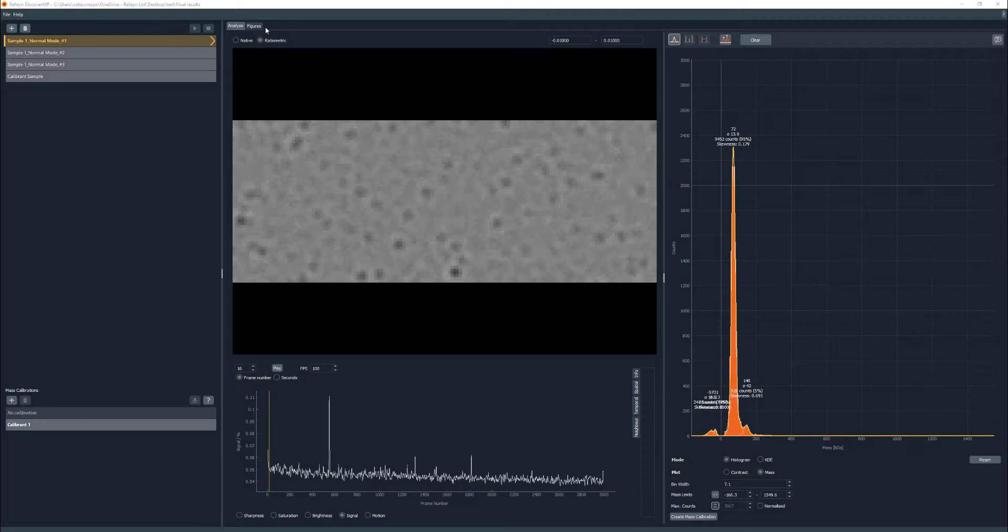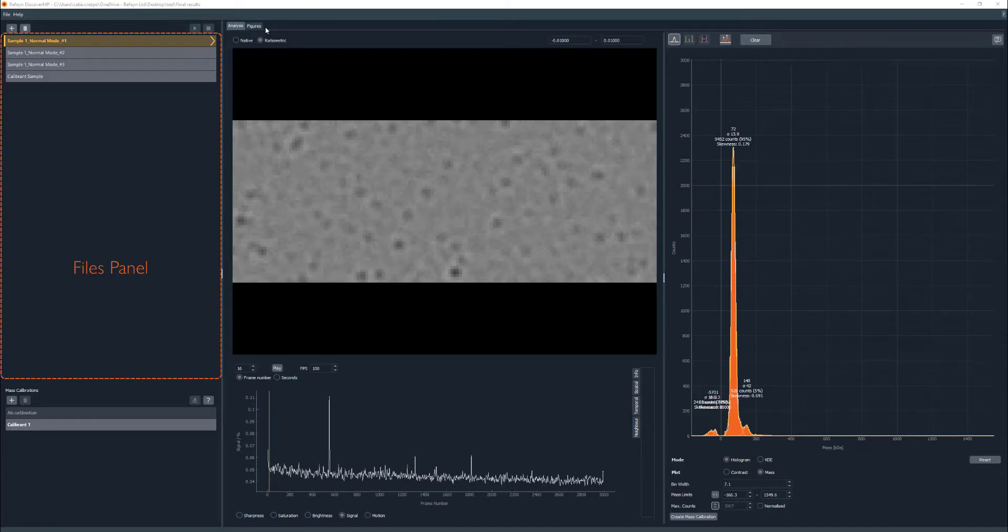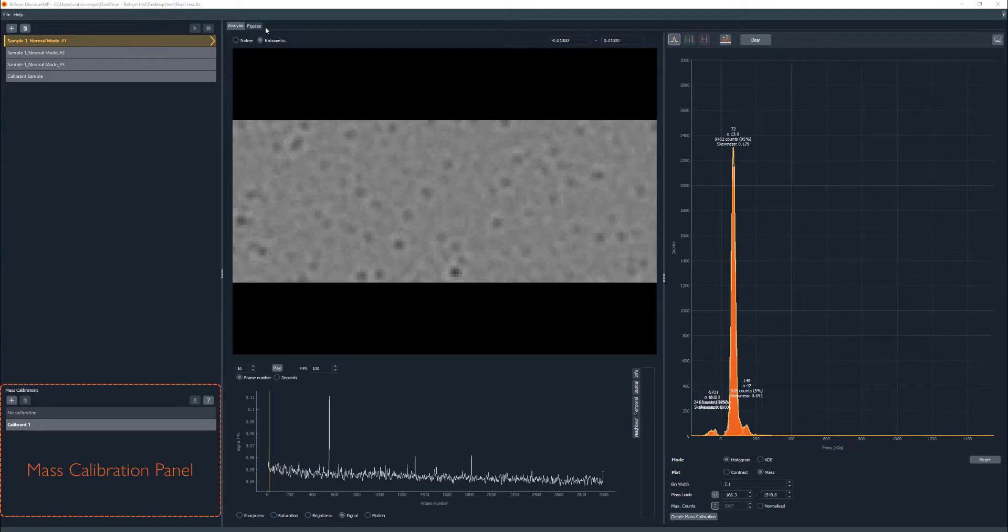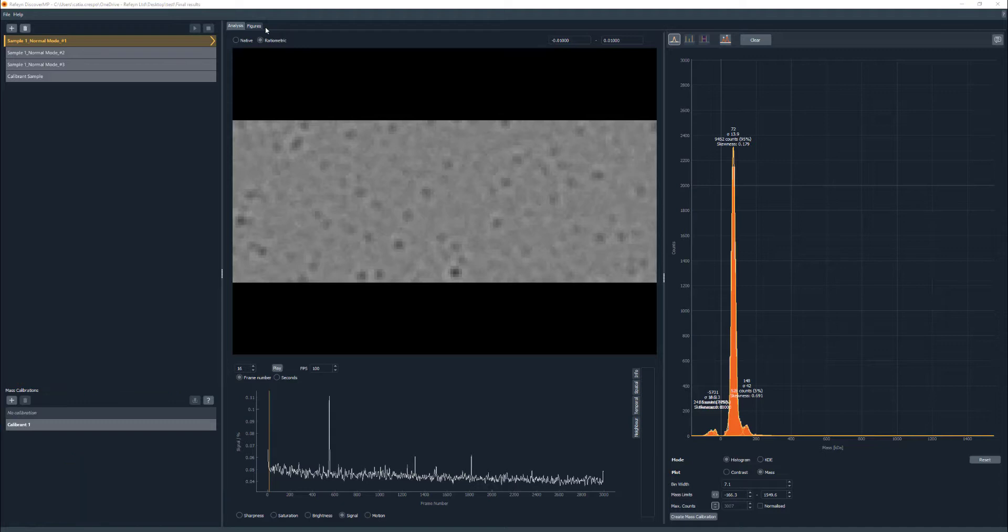After loading files into Discover MP, different panels are available. On the left, there's the files panel which displays all the different measurements available on the workspace. On the bottom left, there is a mass calibration panel which enables the management of the different mass calibration files.